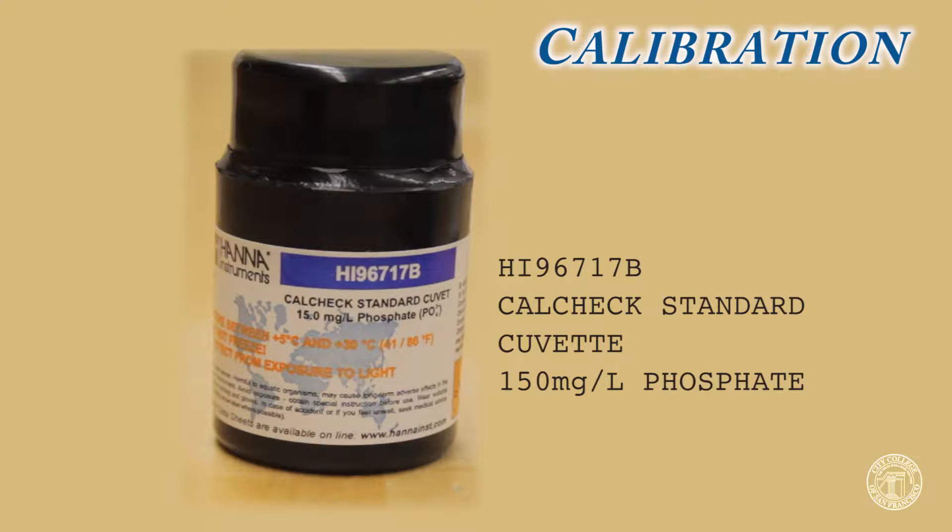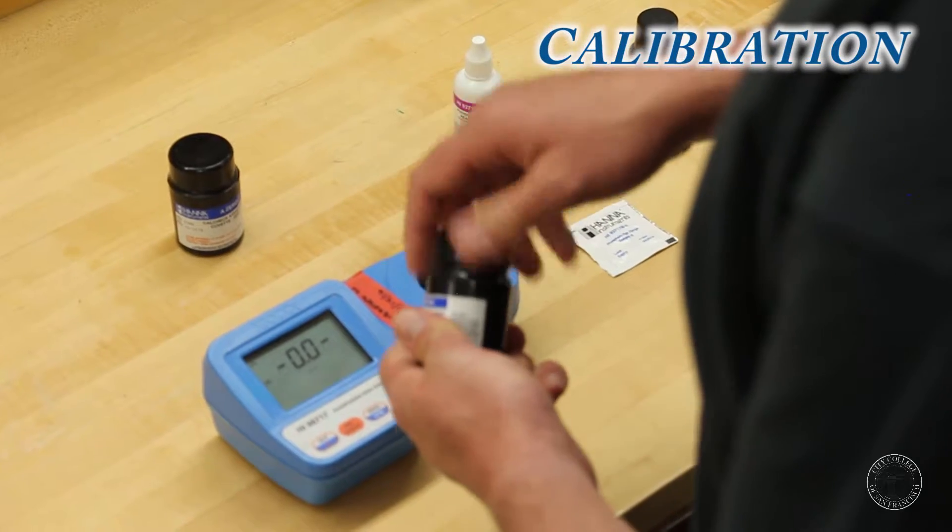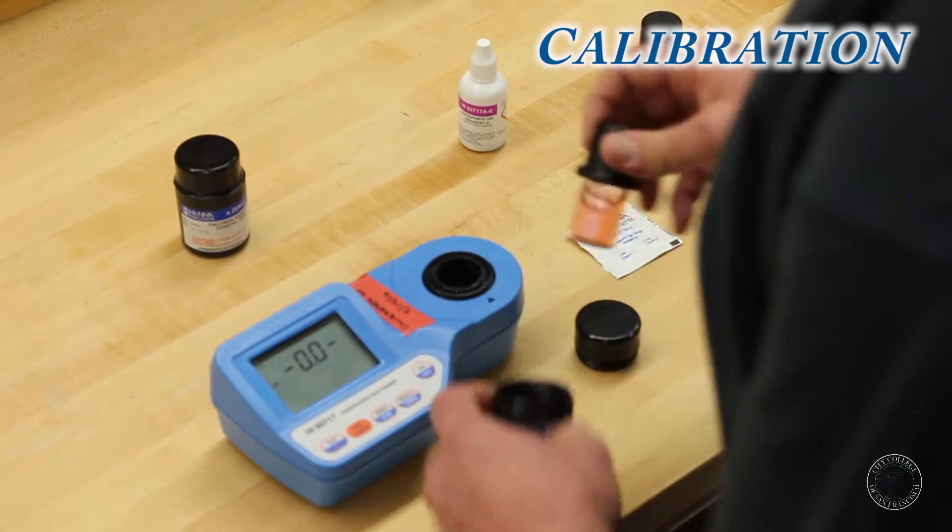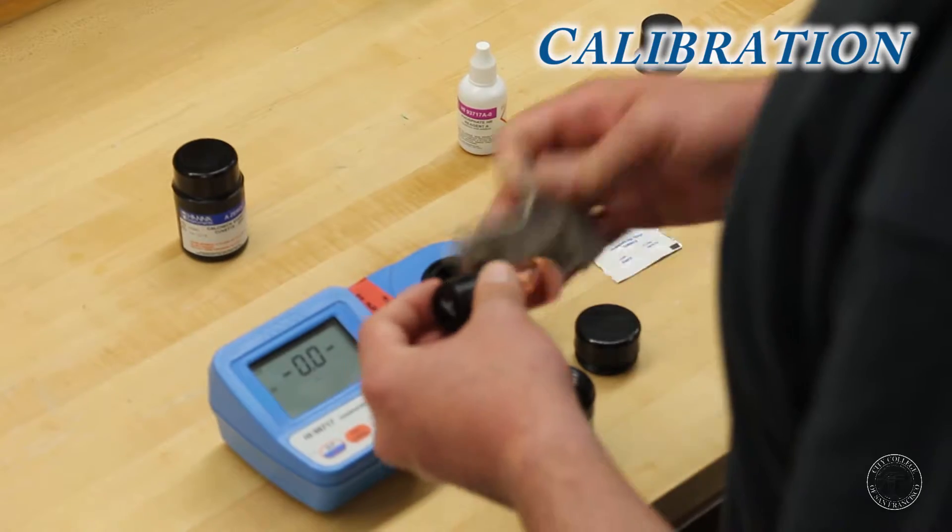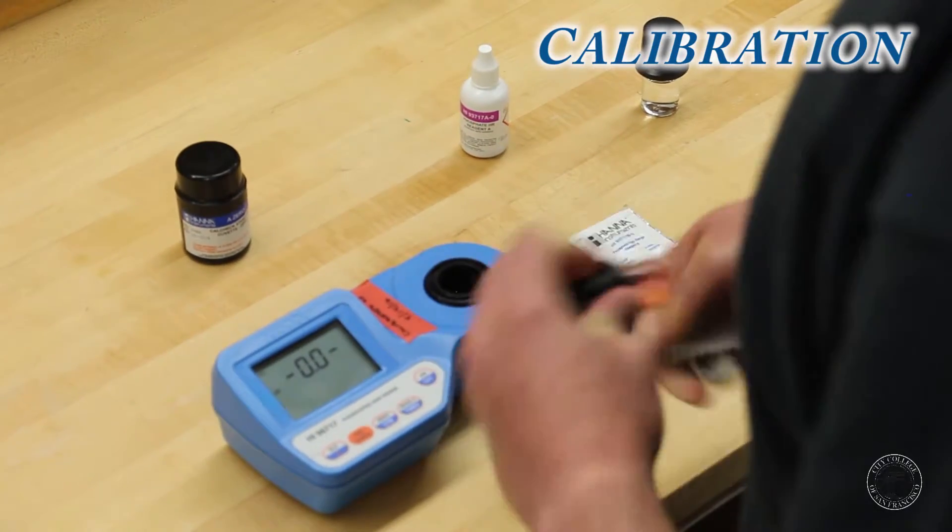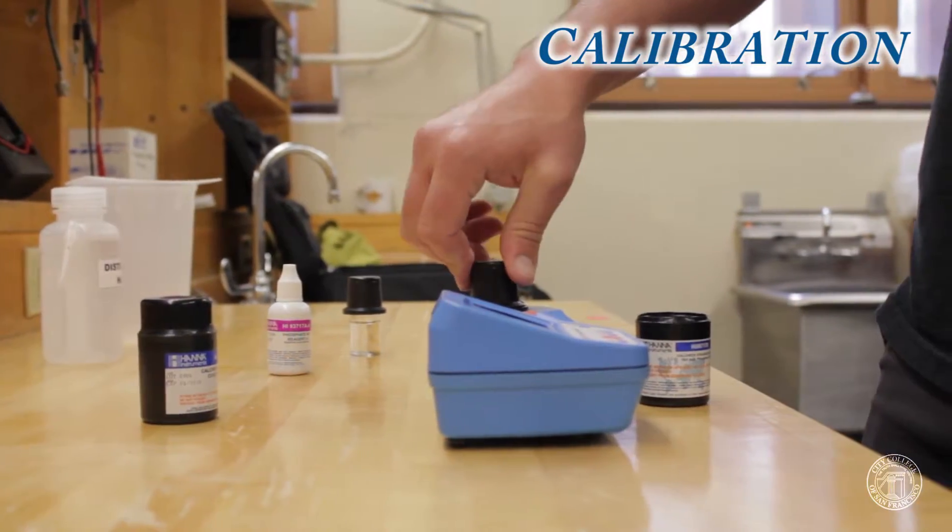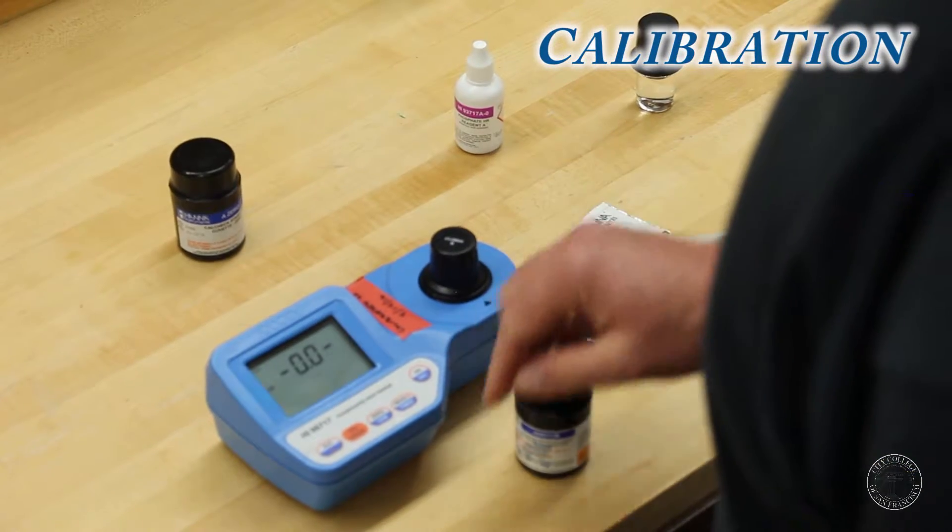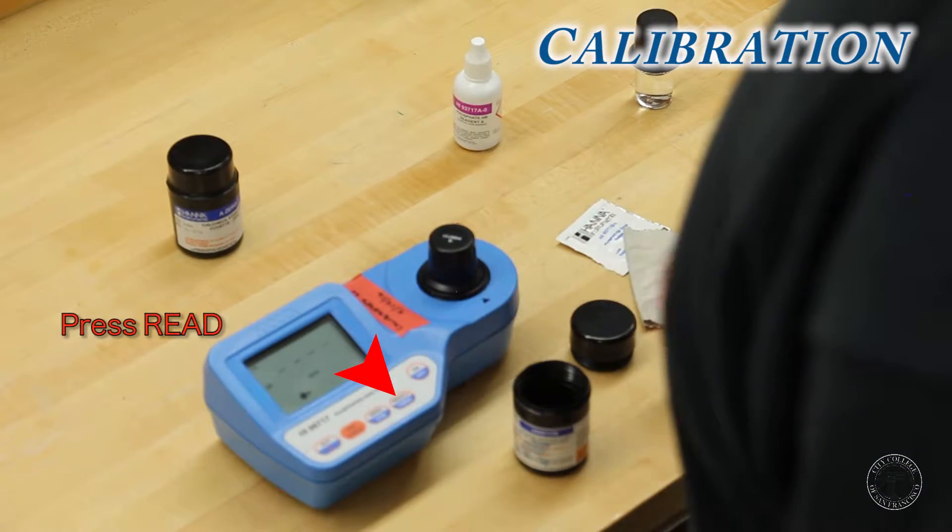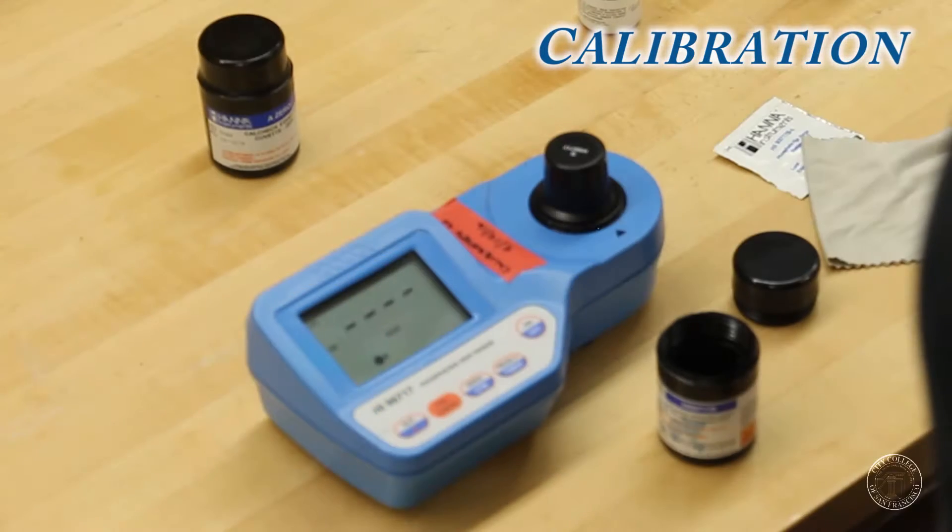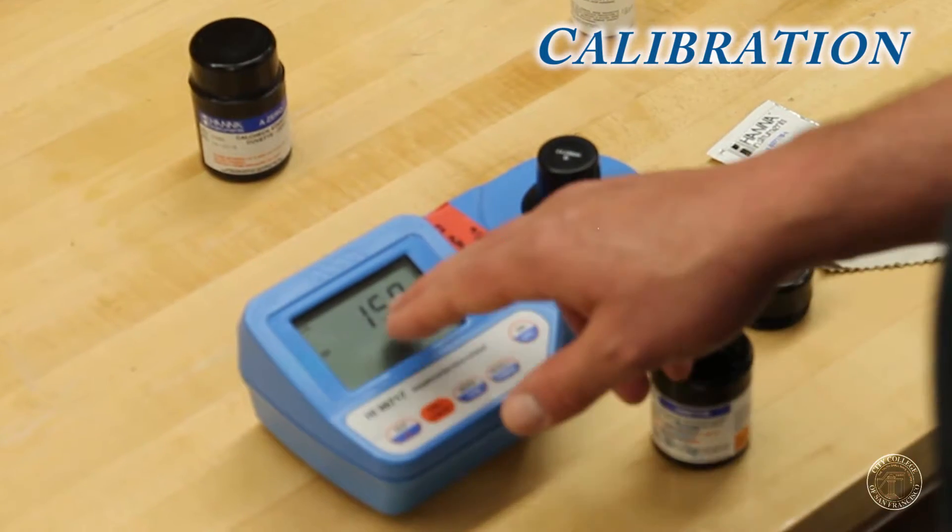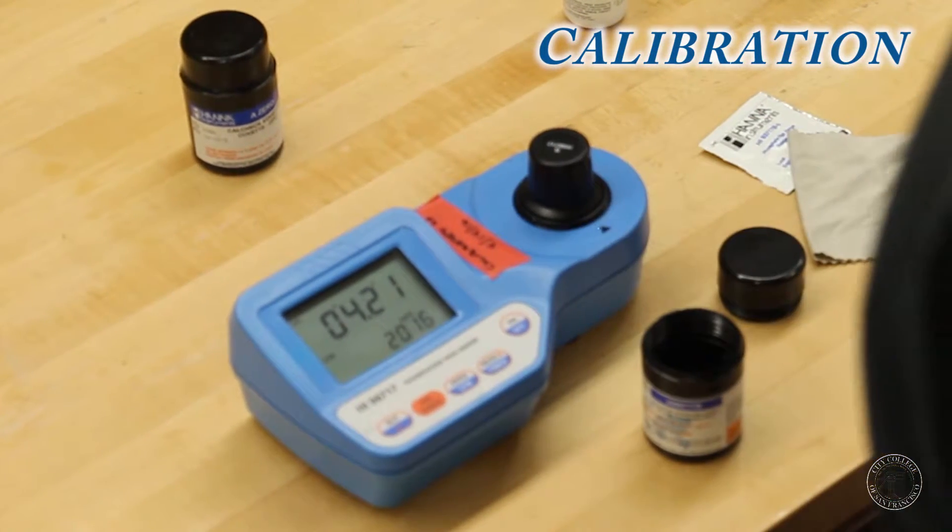Now using our CalCheck standard for dissolved phosphates, it's set to be 15 milligrams per liter as the standard. Wipe the cuvette, put it in until it clicks and the arrows are lined up. Then we simply click read and wait for the lamp to read the standard. And the standard reads at 15 exactly as it should.